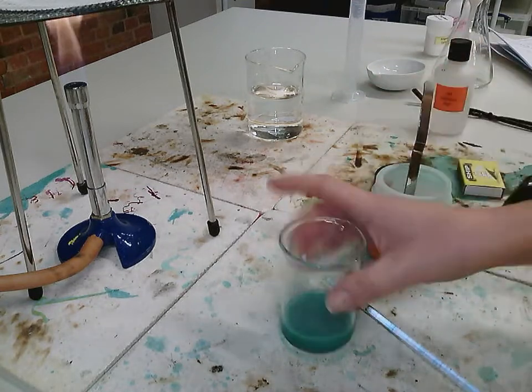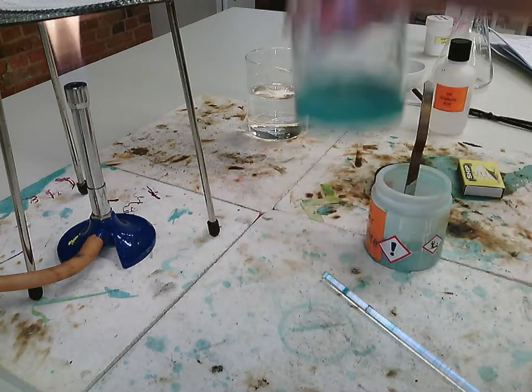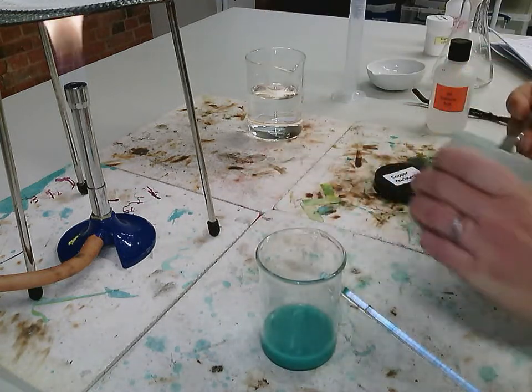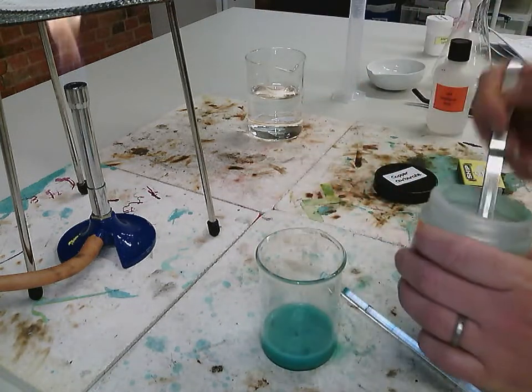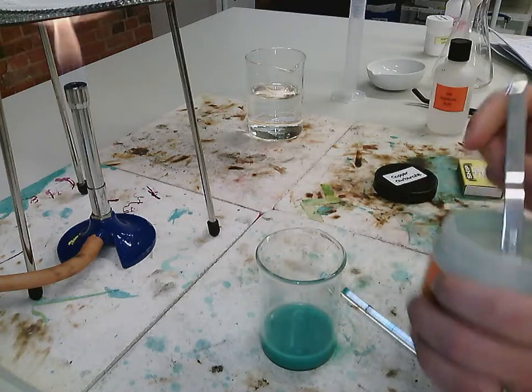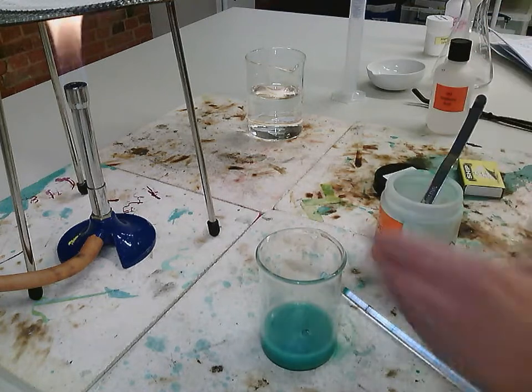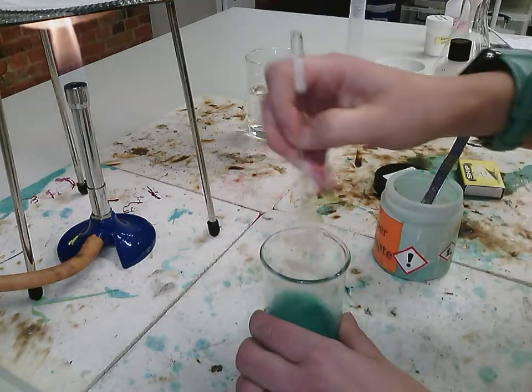And what I want it to do is I want it to stay murky, because what we're going to do is we're going to filter the excess copper carbonate off. So just keep adding it. And you can see it's still bubbling, but not quite as much. So I'll just keep adding it. Give it a stir.